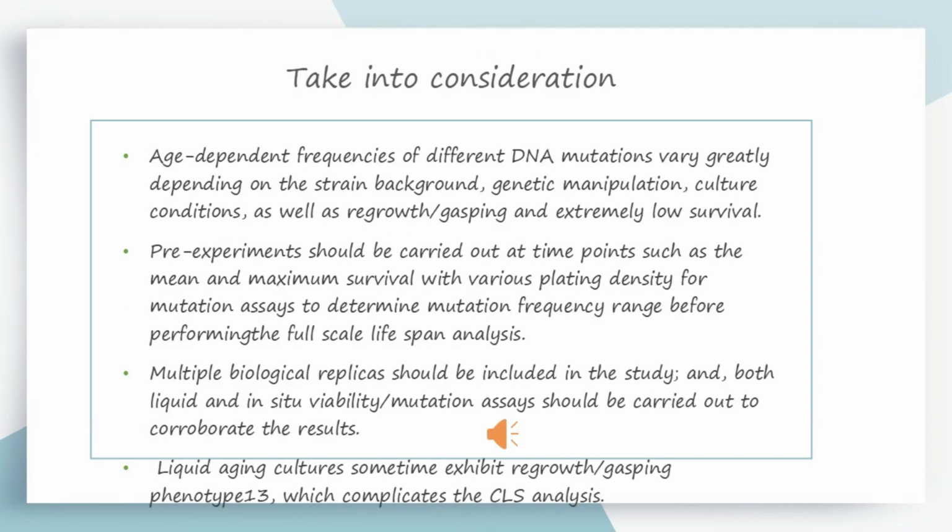Take into consideration that age-dependent frequencies of different DNA mutations vary greatly depending on the strain background, genetic manipulation, culture conditions, as well as regrowth/gasping and extremely low survival. Pre-experiments should be carried out at time points such as the mean and maximum survival with various plating density for mutation assays to determine mutation frequency range before performing the full-scale lifespan analysis.